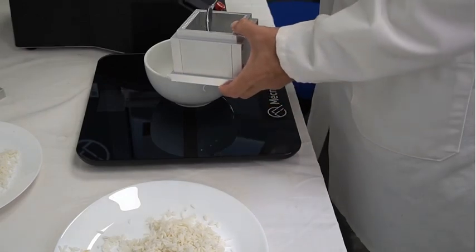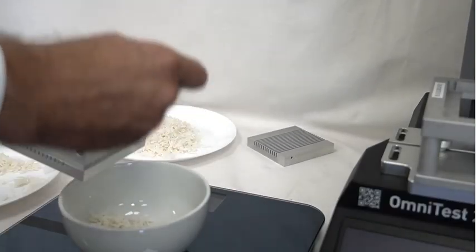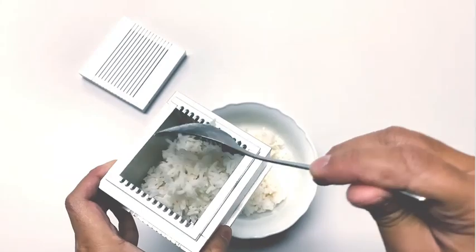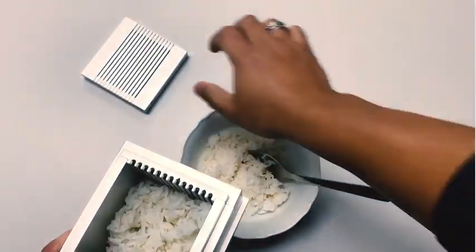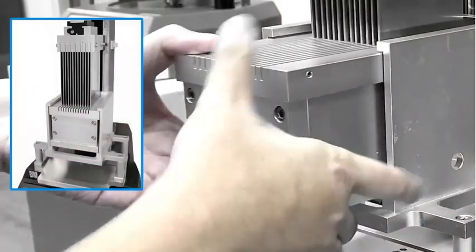A standard rice texture test uses 2 batches of cooked product. Each may be a different variety, the same variety, prepared or grown in a different way, or from a different supplier. Split the batches into 3 equal weight, bulk test samples. The mean results give a confident conclusion for that batch.